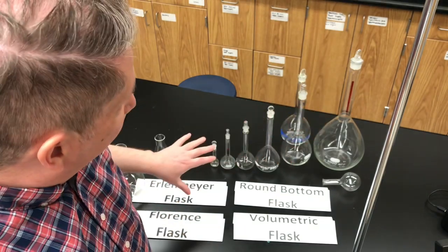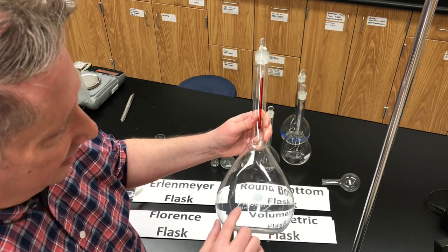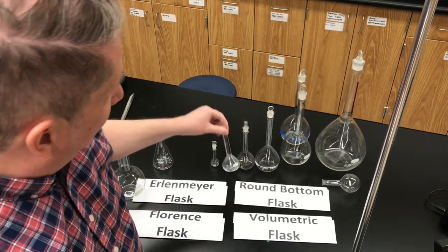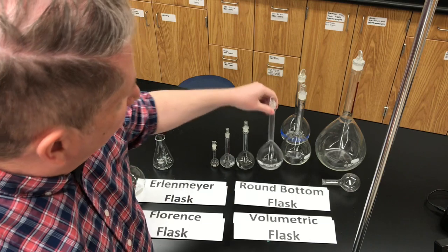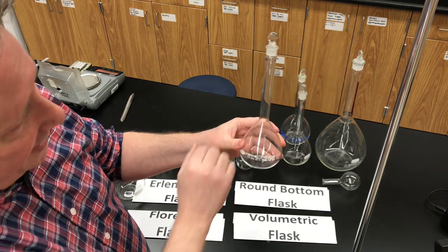They come in a variety of sizes. Often in the lab, the lab assistant needs to make a large volume of a solution, so she might use a 2-liter or 2,000-milliliter volumetric flask. Sometimes we want to make a very small volume and we use a 50-milliliter volumetric flask. They come in a whole range of sizes. They've got this characteristic shape — sort of a teardrop-shaped bottom with a flat base and a long narrow neck.